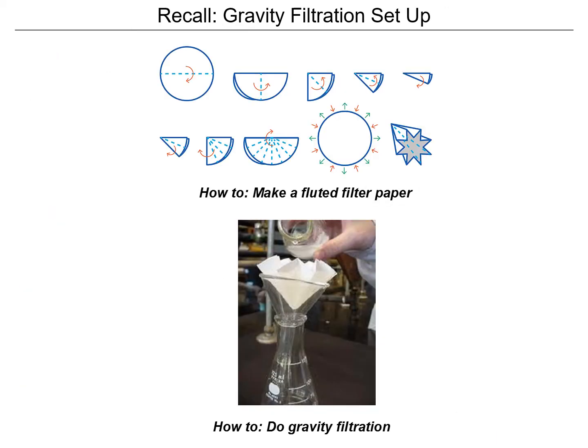To recall, this is the procedure to make a folded filter paper. We're going to make this star-shaped filter paper that is placed inside one of our funnels, and the liquid is let to pass through while the magnesium sulfate stays trapped in the paper.